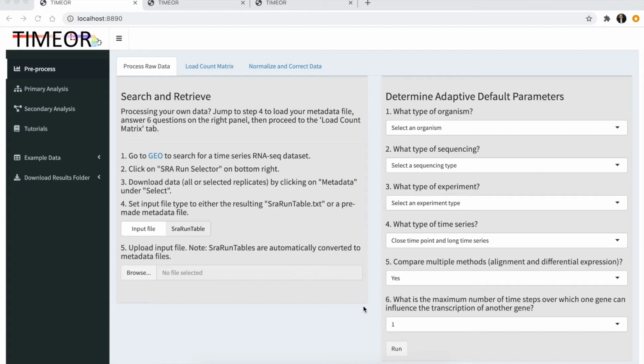will be giving a quick tutorial about TIMEOR, Trajectory Inference and Mechanism Exploration using Omics data in R. This is the first automated interactive web and command line time series multi-omics pipeline method for differential expression and comprehensive downstream analysis. TIMEOR reconstructs interpretable and user-guided gene regulatory networks, and specifically, TIMEOR's web interface leverages users' knowledge of the biological process by providing options to the users during each analysis phase of these three.